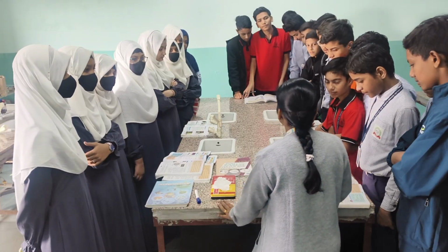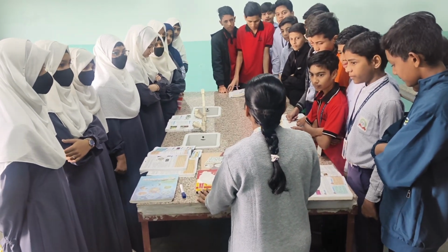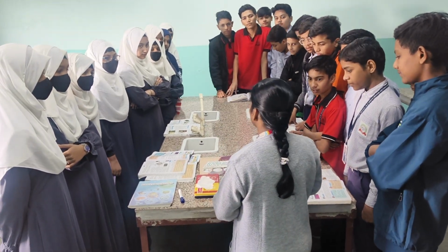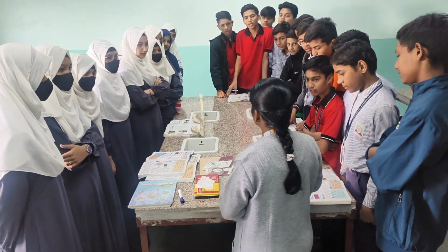From this practical, what we have discussed today is that we see the lactobacilli that are present in curd. So today's practical is over. Next practical we will take in the next lecture. Okay?